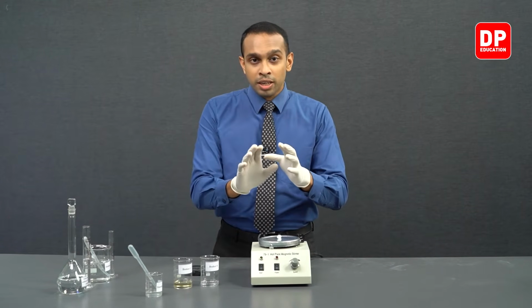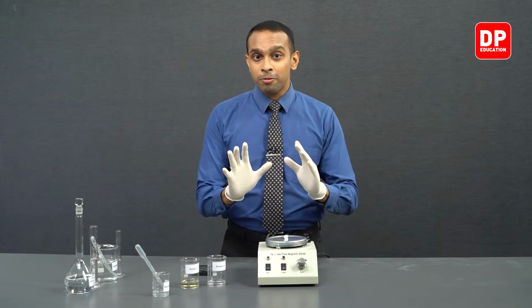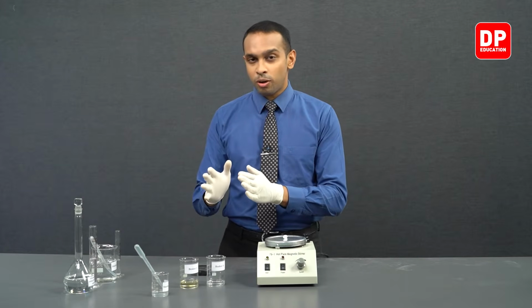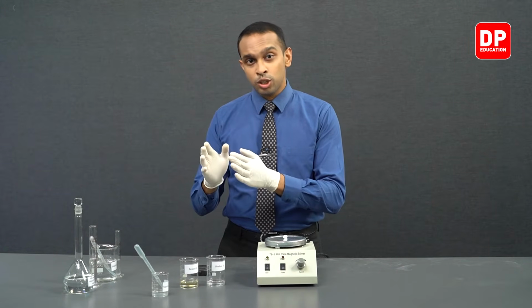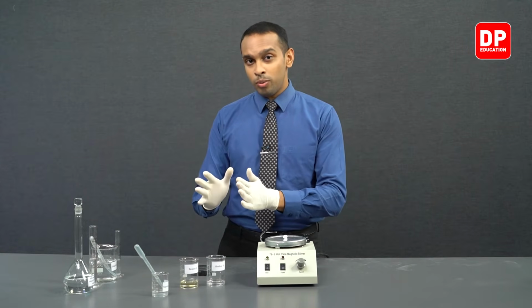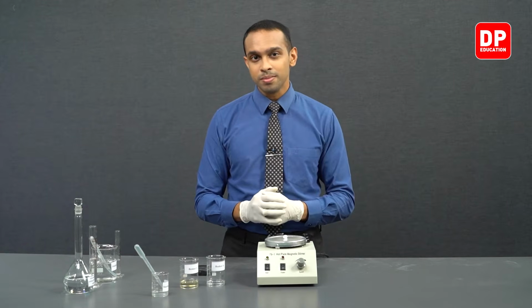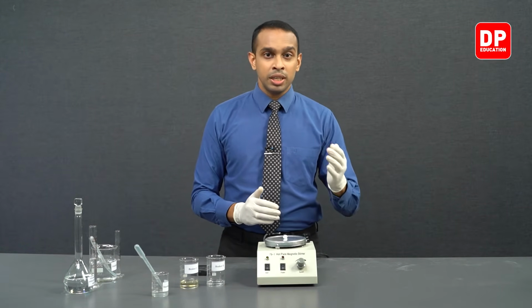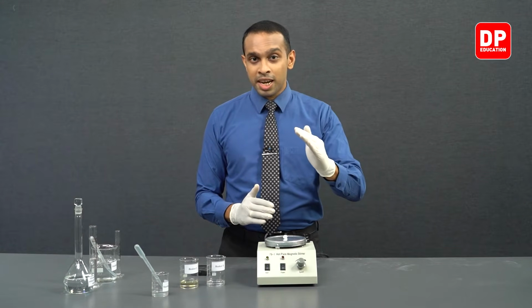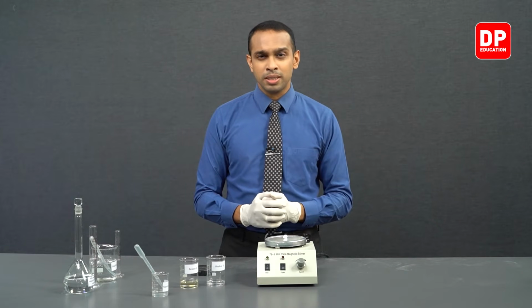So when all of these reactants were added together, the overall volume of the medium was 50 cubic centimeters. So we are going to start changing the concentration of Fe3+ ions in the medium by decreasing the volume of Fe3+ that we take into the final reaction mixture. So initially we measured 25 cubic centimeters of Fe3+. Now in the second reaction we are going to only take 20 cubic centimeters of Fe3+.